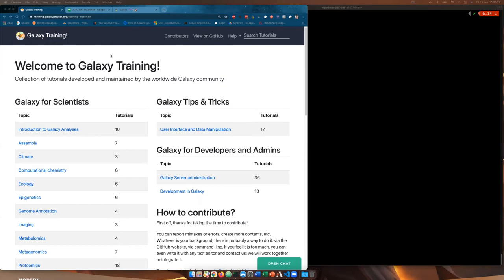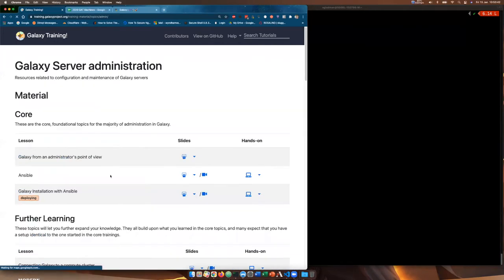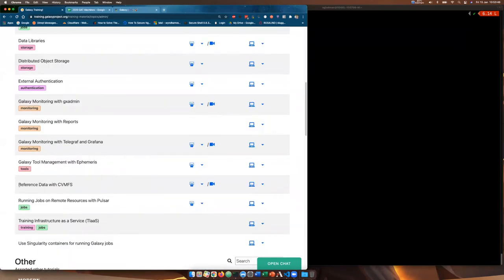To get started we all need to be on the Galaxy Training website at training.galaxyproject.org and then we need to go to Galaxy Server Administration. If we scroll down you can see here we have a tutorial called Reference Data with CVMFS. There's a slideshow available, a video of the slides and also a hands-on component. Hopefully by now you've all seen the video of the slides; if not I suggest you go and look at those first as that explains how reference data works in Galaxy and also what CVMFS does to help us with that reference data.